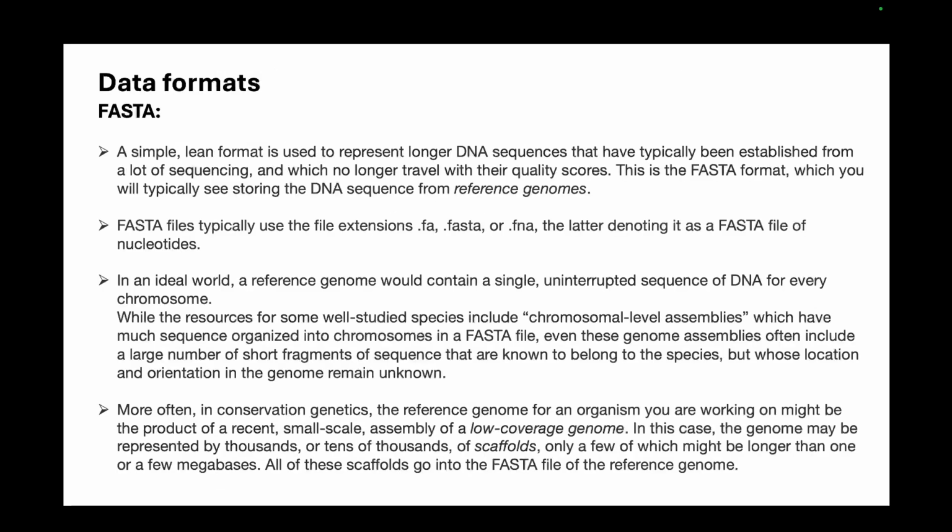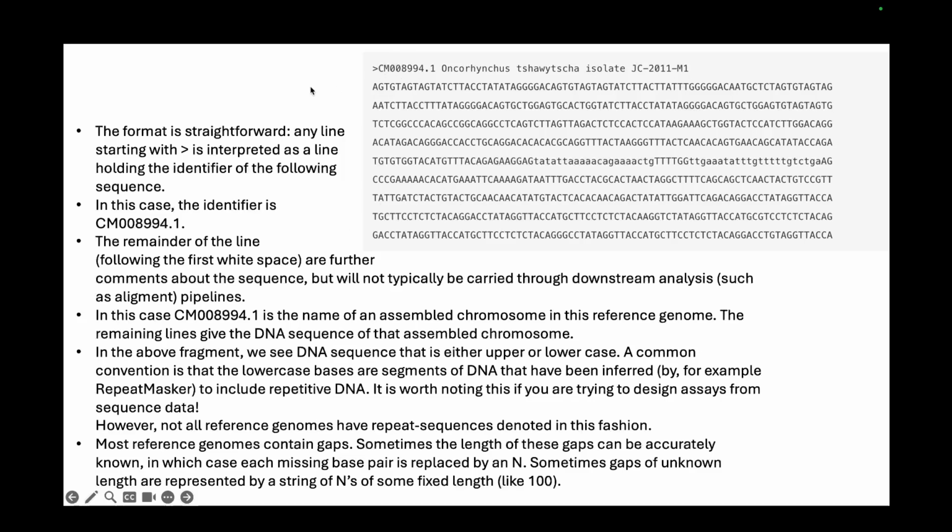Okay. Now we come to different types of data formats, right? So before we go into the things that we can do with the data, let's look at certain types of data formats. FASTA is one of the simplest data formats for genomic or proteomic data. You have a file like this. On the header front, you'll have a line which is basically the identifier of the FASTA file. It starts with this greater than sign, and below that will be the stretch of the sequence, in this case the DNA that has been sequenced, or it can be proteins as well, as in amino acid sequences.